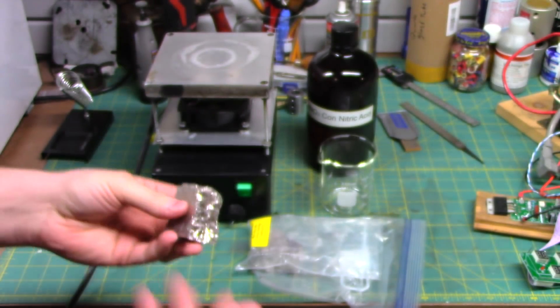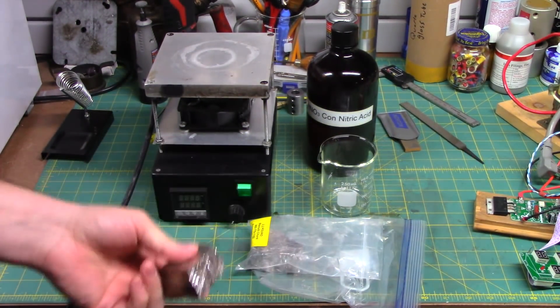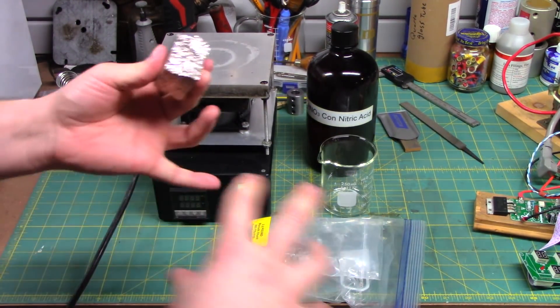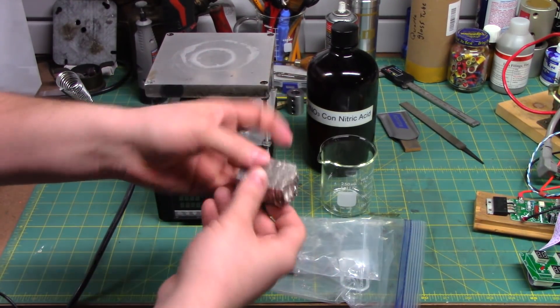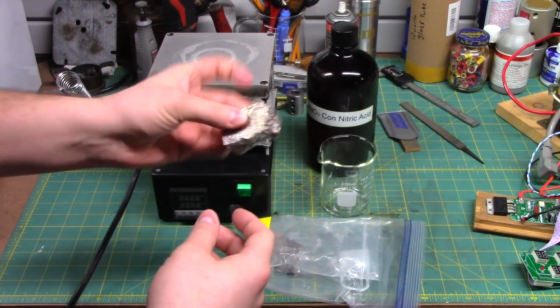And of course, you can melt this down and make the cool bismuth crystals with all the different colors created by the various depth of oxidation layer. But we're not going to be doing that today.